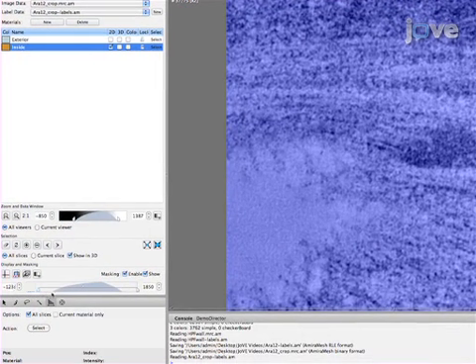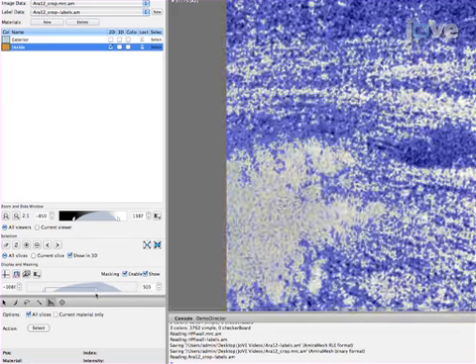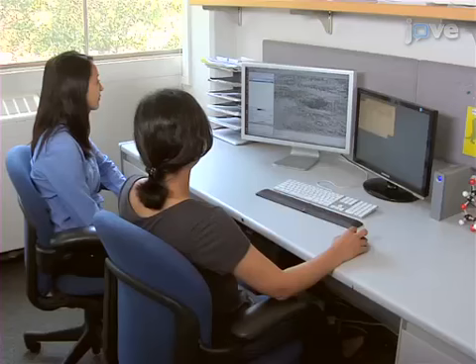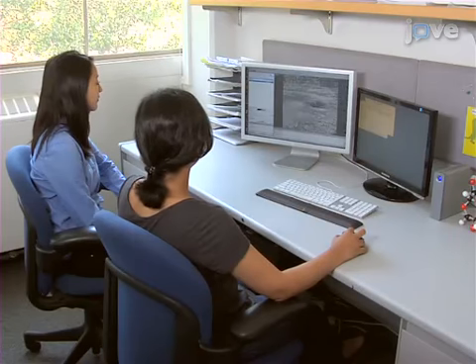For features without clearly distinguishable margins, use the Threshold tool by selecting the threshold icon. Adjust the slider to adjust the density within the desirable range so that only the features of interest are masked. Click the Select button, then add a selection by clicking the button with the plus symbol or with the shortcut A. Generate a surface for visualization and qualitative analysis, as described in the Text Protocol.